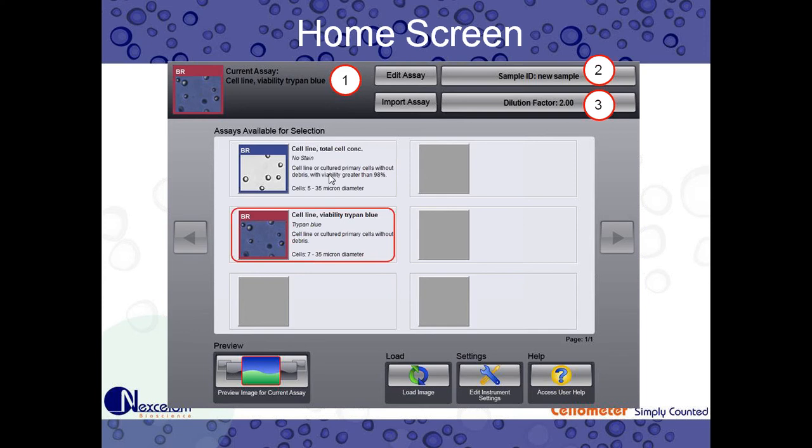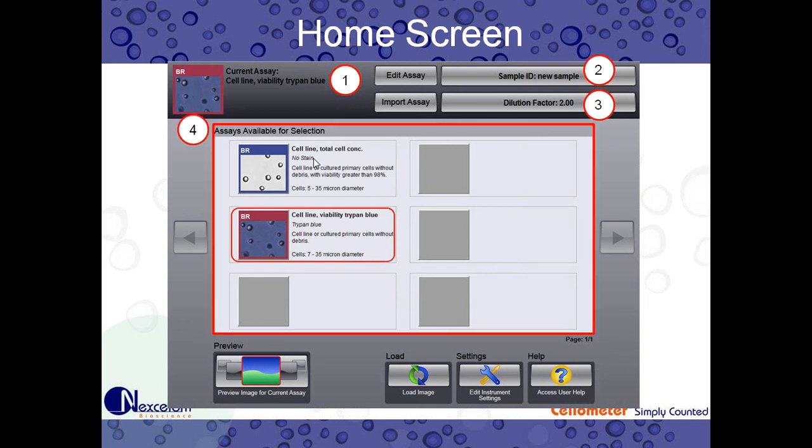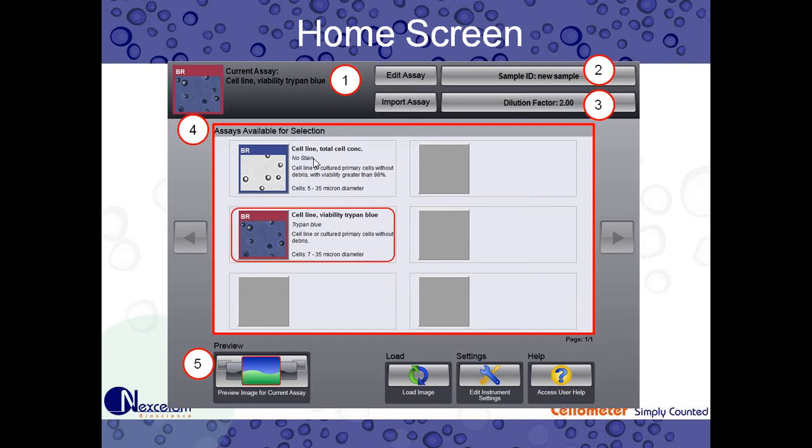And then we have number four, our assays available for selection. There's only two here, but you can see there's four other spaces. And there's many, many other spaces you can fill with customized assays and cell types. But that I'll touch on in a little bit. Number five, once we select our assay and we're ready to perform a cell count, we can click preview. This will give us a live image feed of our cells on the counting chamber, where we can focus and then count.